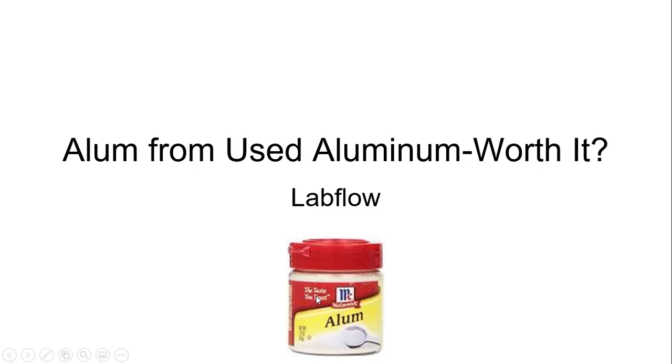Hi class. So today's lab, or this week's lab, is alum from used aluminum. This is a lab that we actually do at Citrus. I do it with my class.